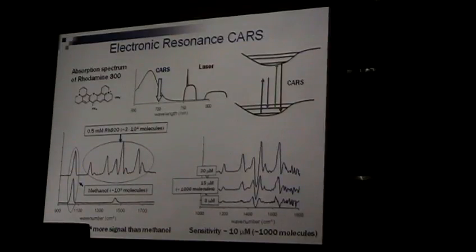So what we tried was, we just kept lowering the concentration to see what our sensitivity limit is. We ended up with something like 10 micromolar. Here, our focal volume is about 10 to the minus 16 liters, and if you just plug in, this is conservative, we have something like a few hundred molecules. There's a vibrational spectrum taken in 1 second.